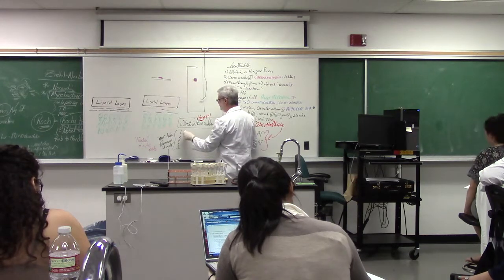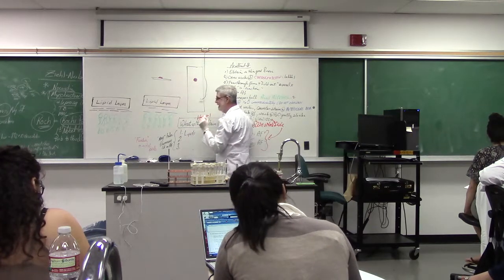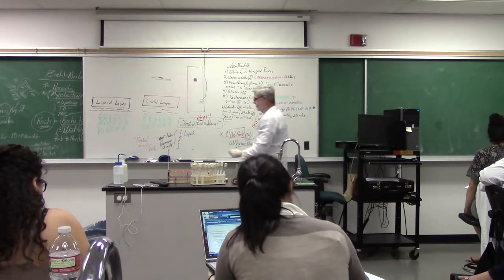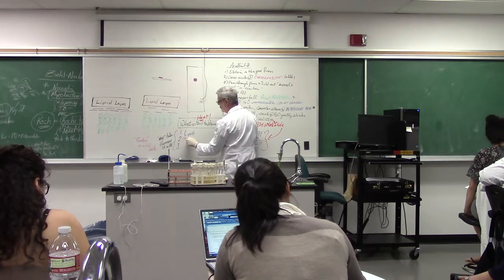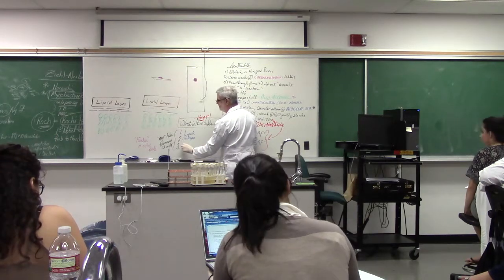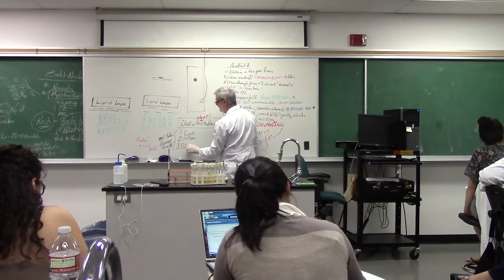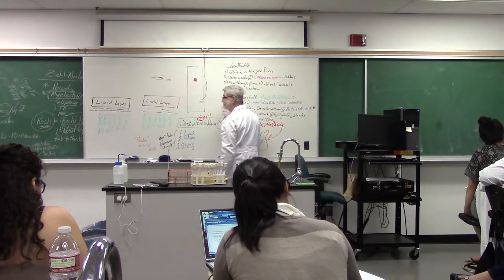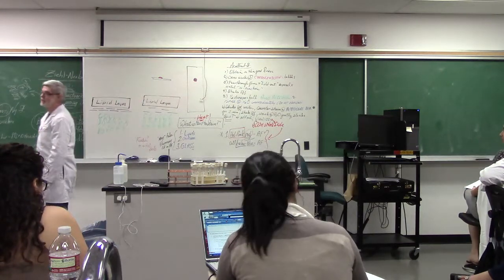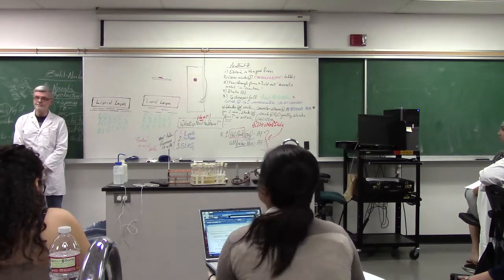All right? Anybody read ahead and find something else? Endospores. And the last one, you'll never guess, glass. Glass is hard to stain. Guess what? With carbol fuchsin, if you overheat it, every one of these will take the carbol fuchsin. Your glass will be hot pink and you can never get it out.